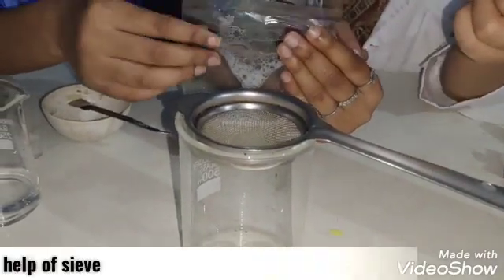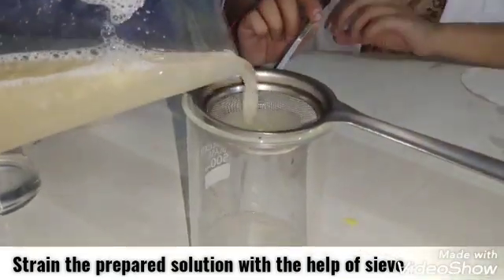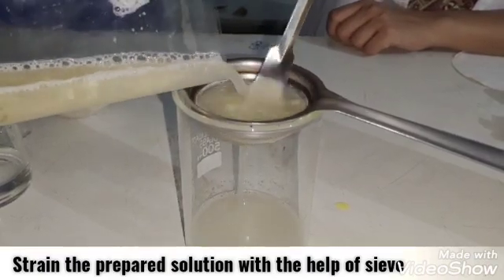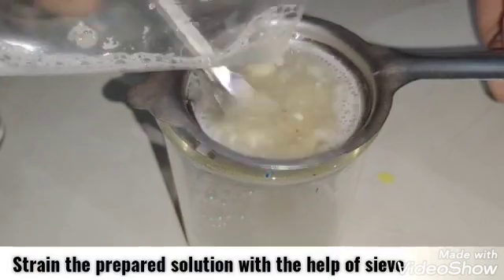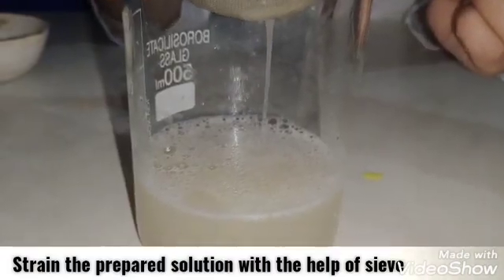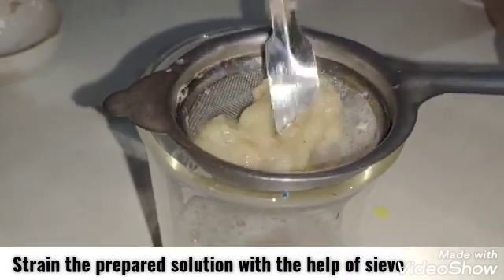Now, with the help of cheesecloth, filter the solution. We can also have double filtration, but right now we are having only single filtration. Here we get our filtered solution.